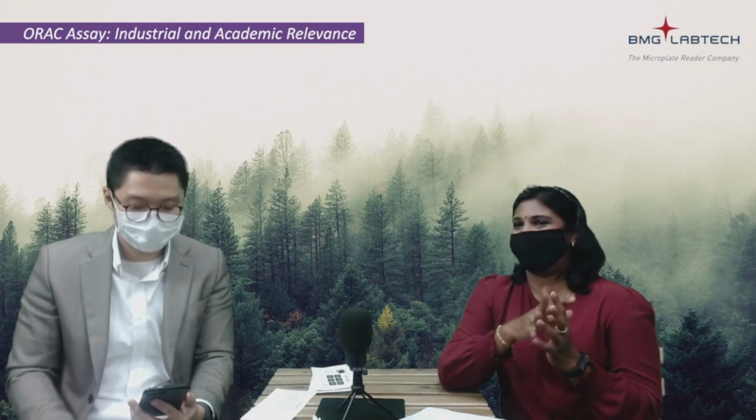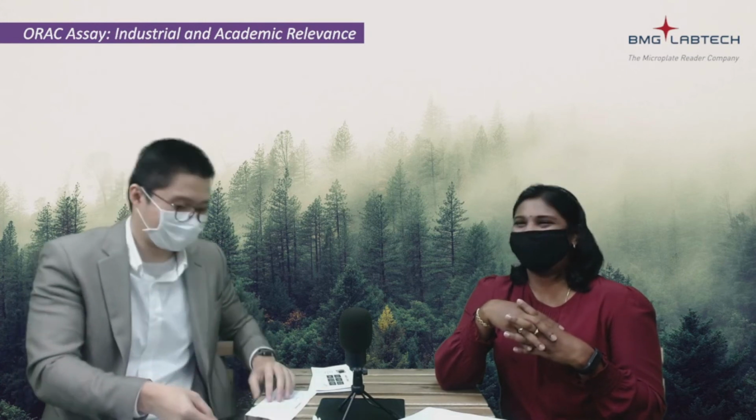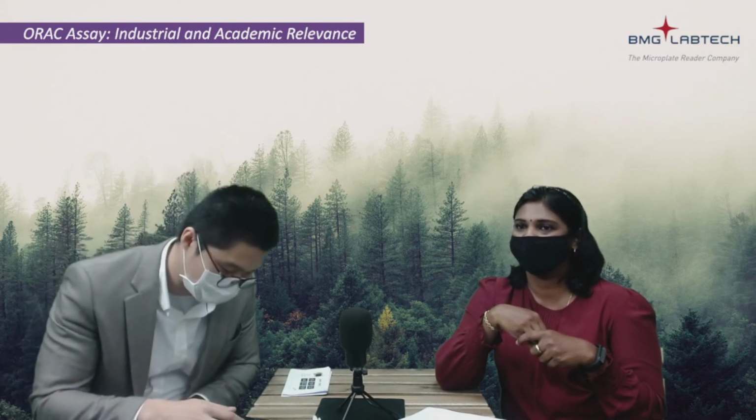Or may I know which type of solvent is more recommended? Thank you. So that's on lipophilic question. I expected there will be questions on that. For answering his question, you can use randomly methylated cyclodextrin, which is very good. We call it the lipid solubilizer, or lipid enhancer, for the extraction of lipid-based antioxidants. I hope that answers your question.